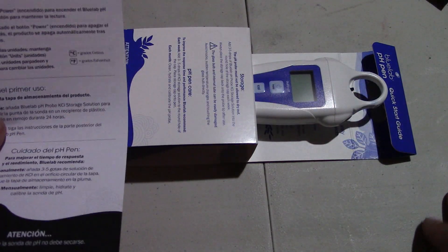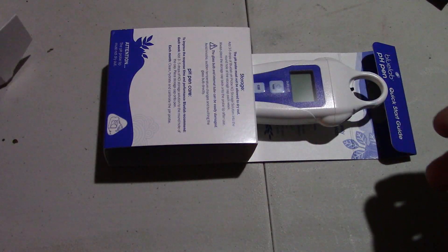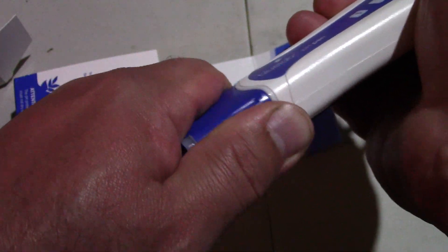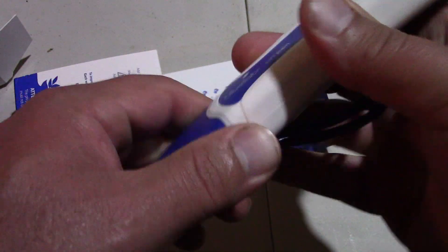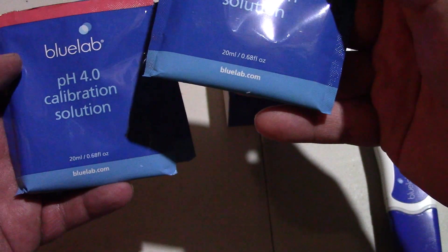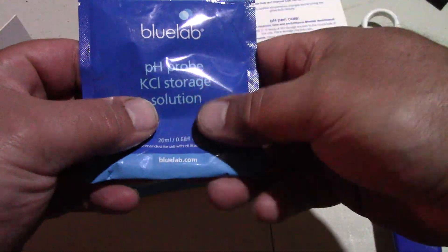Let's see what comes in the box. This is in a different language so I can't really read it. You've got your pH pen. It's kind of on there good - I hope I don't break this. It's not really working so strong! Anyway, that's how it comes. There's some stuff in here - we've got a little bag of solution, another bag of solution, and that's it.